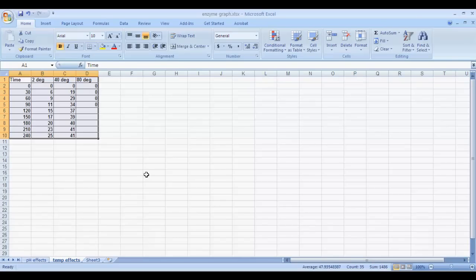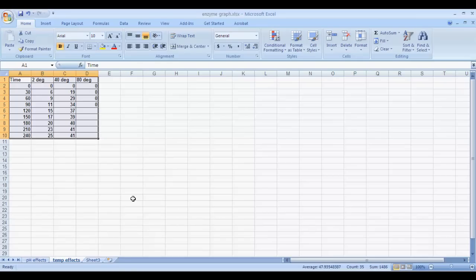In this video I'm going to show you how to create the graphs for the enzyme activity lab. Remember that you did two sets of experiments: one examining the temperature effects on enzyme activity and one examining the effect of pH. I'm going to show you how to do the temperature one, but the one for pH is more or less the same.